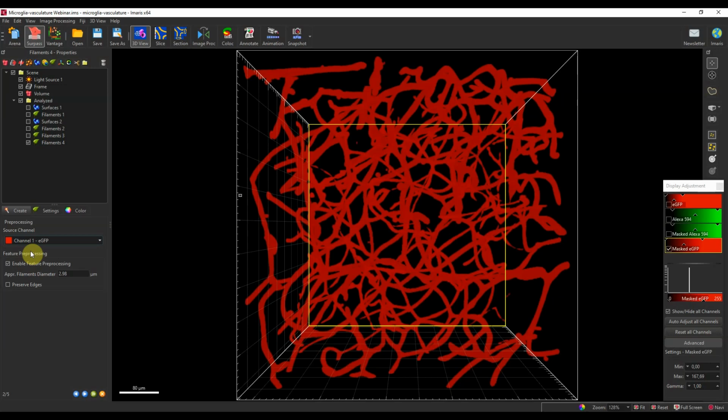However, in all other options, we would generally recommend to first generate this mask channel, what we just did previously, and then use that one. Now, just for demonstration purposes, I will have the source channel as the original channel, and I would click here on the next step.